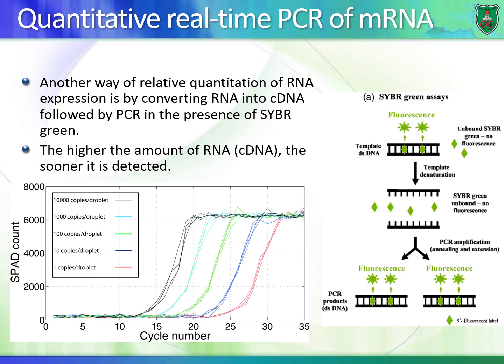That's the first technique, we do a PCR reaction of the cDNA, so quote unquote, that is the messenger RNA, in other words, and it can be quantitative, meaning that you can quantify the number of molecules of cDNA or messenger RNA using real-time PCR. We talked about real-time PCR before when we discussed PCR. And I said that one of the basic techniques is using SYBR Green, a small chemical that binds to double-stranded DNA, and when it binds to double-stranded DNA, it fluoresces. And the more DNA there is in a sample, the more fluorescent there would be, right?